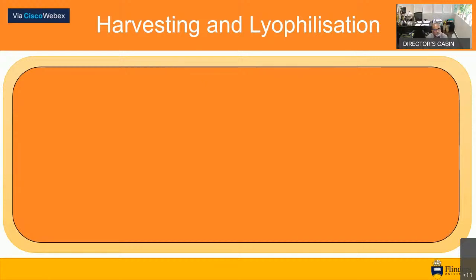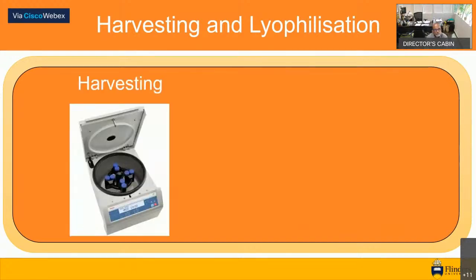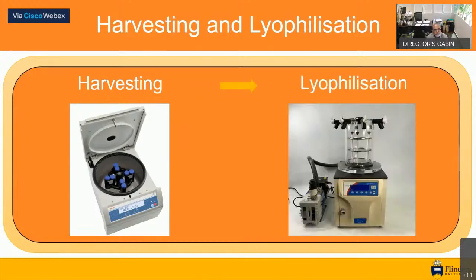Upon harvesting, microalgal cultures are transferred to appropriate centrifuge tubes, which should be pre-weighed to allow later determination of the mass of biomass accumulated. Biomass is centrifuged for 10 minutes at 4,500 rpm to separate the microalgal cells from the media. The supernatant is then removed and discarded, and the pellet is stored in the -20 freezer until further use.